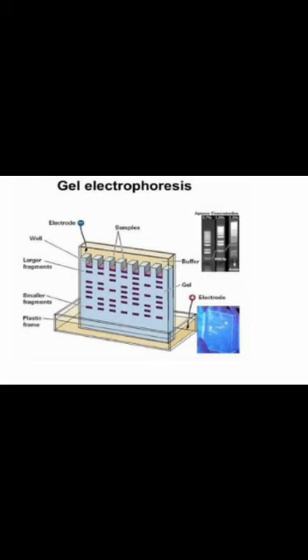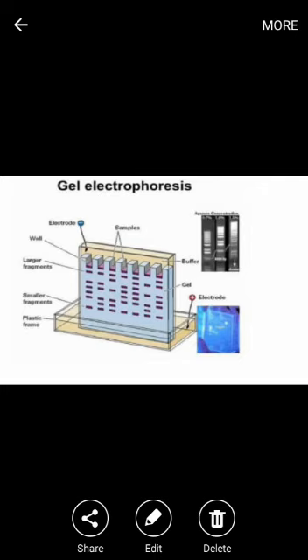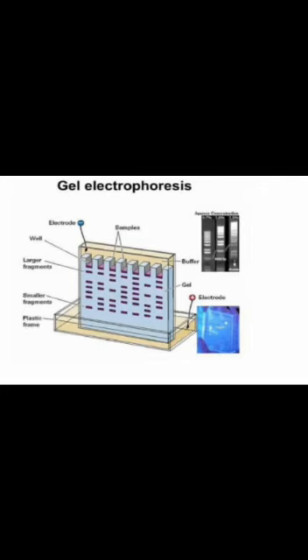This means that small DNA molecules will travel a greater distance through the gel than will large DNA molecules. And gel electrophoresis involves an electric field.